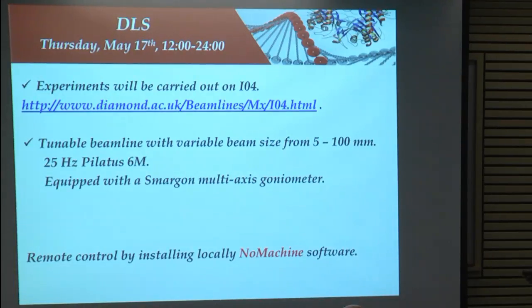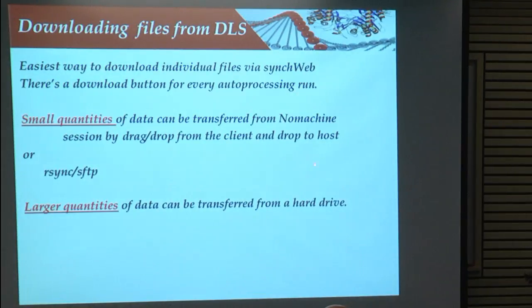Okay, and we're going to use the NoMachine software. We're going to get more explanation tomorrow from Nick and Neil. Again, we have instructions on how to download the MTZ and the PDB files. If you have larger data, you can bring a hard drive, which is not possible now because we are remote, but for a small quantity of files, you can also do rsync.